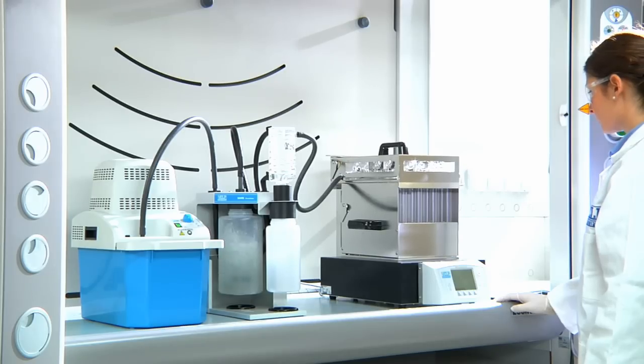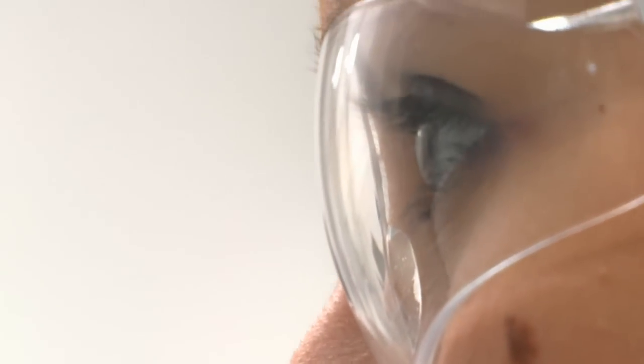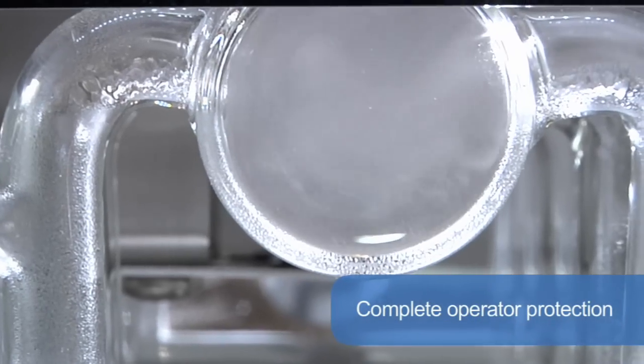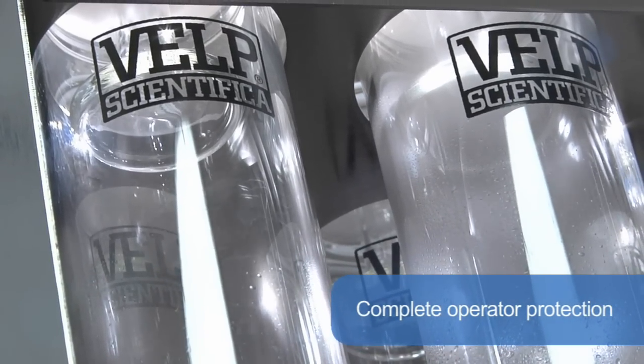Excellent visibility of the samples and any condensed vapours in the manifold give the operator the best assurance of correct operation. Complete operator protection is ensured by starting aspiration of the vapours as soon as the run starts.